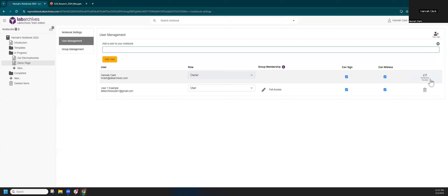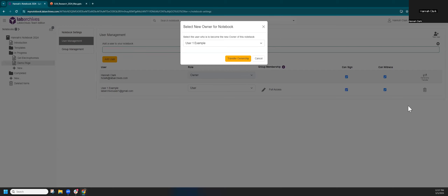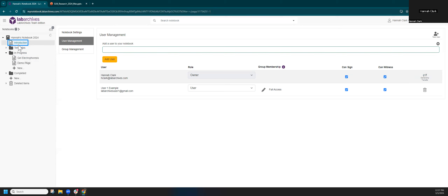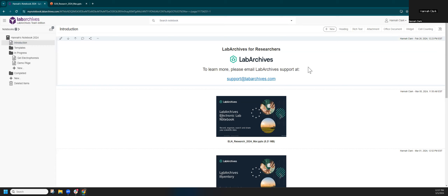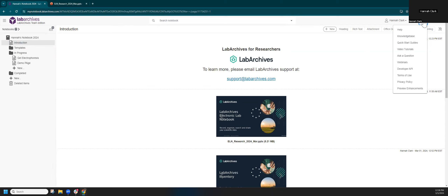Another option is the transfer of ownership — for example, if you set up notebooks on behalf of your PI you may later want to transfer ownership to them, or if you're leaving your position someone else is continuing on with the project. Some features we haven't covered include exporting options — both PDF and offline notebook formats — as well as the activity feed, comments, and email notifications where you can draw someone's attention to a particular page or folder. You can email support@labarchives.com, and the 'i' icon in the top right has all our help resources, knowledge base, and quick start guides.